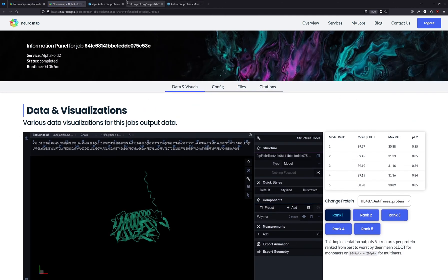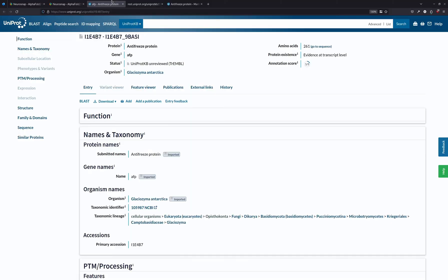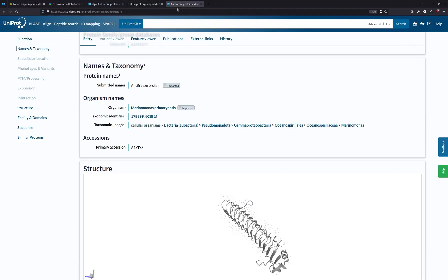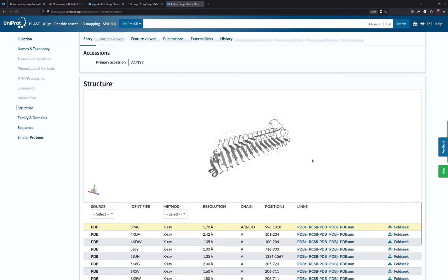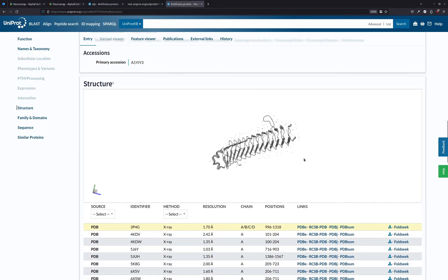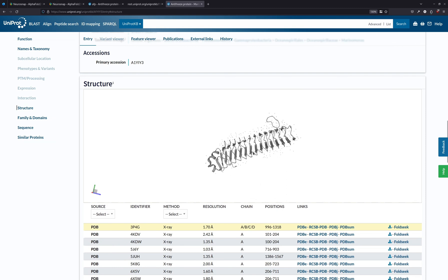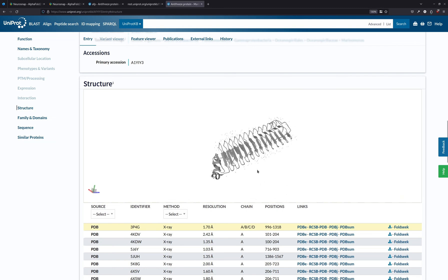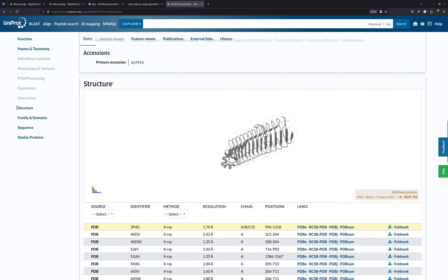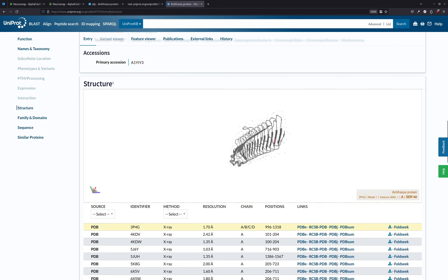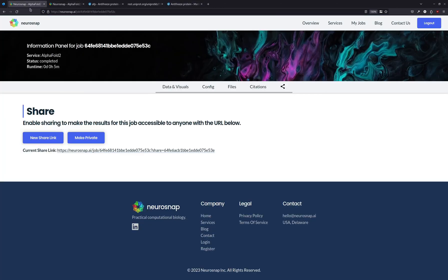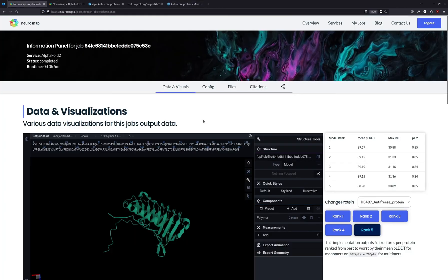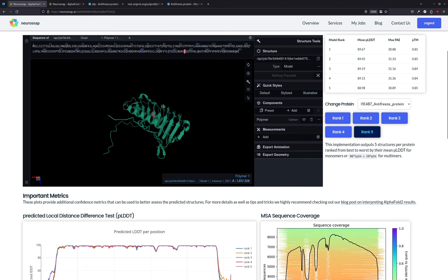On top of that, we can compare it to another antifreeze protein. So this is another antifreeze protein from, I believe, a species of bacteria. And as we can see, it has more or less the same motif, which tells us that this is very likely to be an accurate structure.